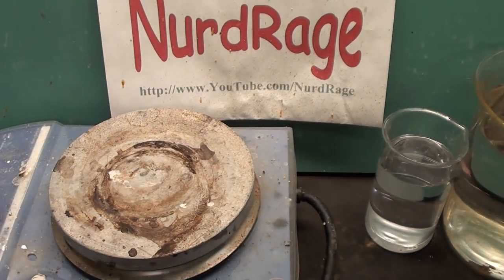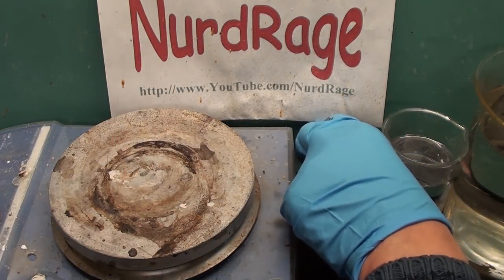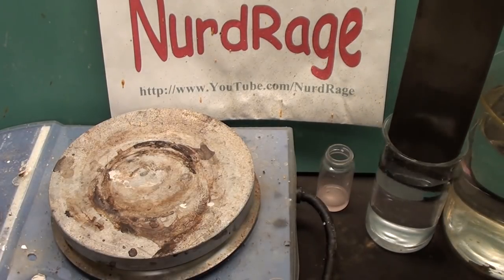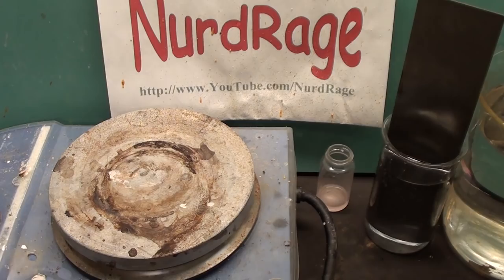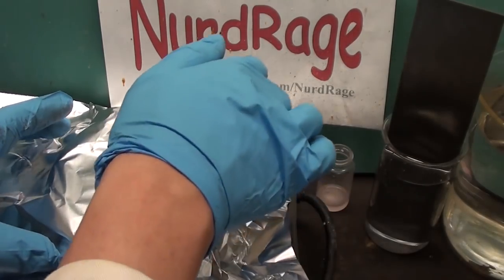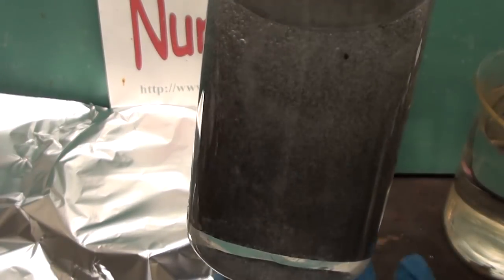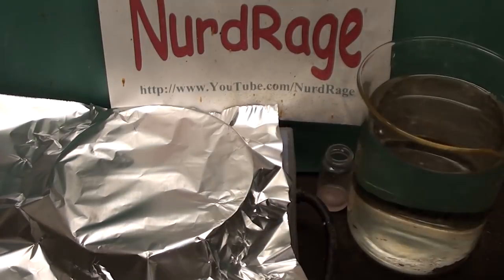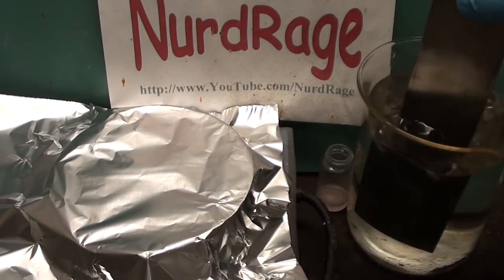Now to make the manganese dioxide electrodes. Just like the previous video, get a titanium strip and after sanding it, etch it with hot hydrochloric acid until the surface starts bubbling hydrogen. Over here I'm covering my hot plate with aluminum foil to keep it clean. Now with the titanium in the acid, when it bubbles evenly it's ready to go. Wash off the excess acid with distilled water.